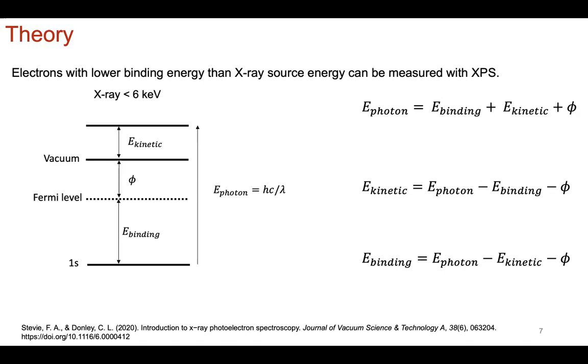Now, that leads me to a side comment that you didn't ask about, but it is important, which is because these peaks are overlapping, it can arise that you have peaks that coincidentally overlap, and for whatever reason you cannot isolate them.